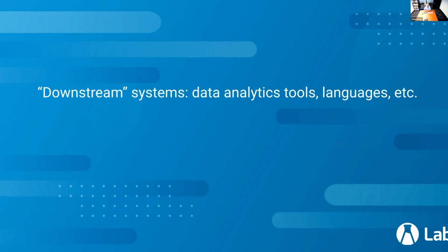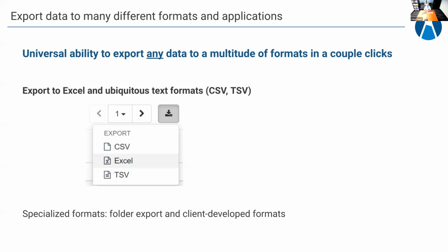All right, so I do want to touch on what I've labeled here, the downstream systems. So again, this is data analytics and visualization tools, languages, processing that takes place sort of after integration within Biologics LIMS. And again, we have many different options here.